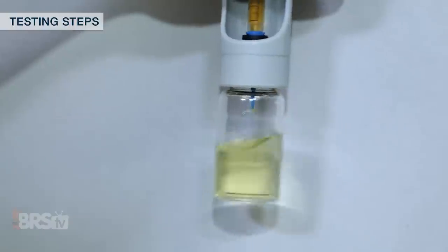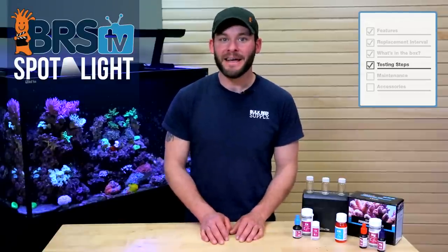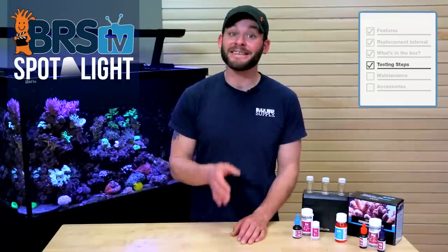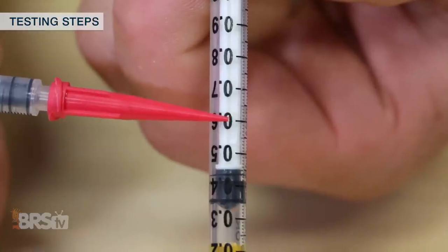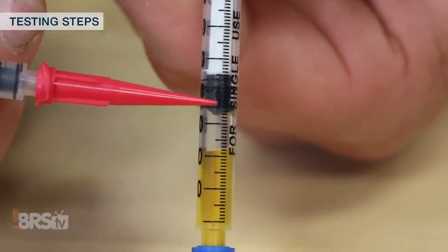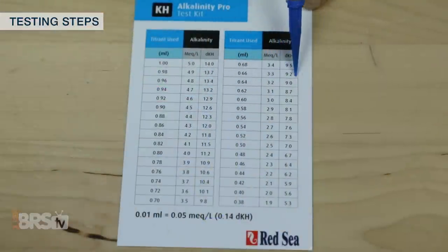For the alkalinity test specifically, if your sample turns yellow, you've gone just a bit too far. These color changes are more improved than previous versions of Red Sea Alkalinity, as we now have a distinct color change that tells us when we've gone too far, which means I no longer have to guess when enough reagent is enough. To find my alkalinity level on the chart, I'll count how much reagent I used starting from the top of the graduations and counting down the syringe. From where the bottom of my plunger stopped when my sample turned green, I can count 0.5, 0.6, and halfway makes 0.65, which I can match to the included chart on the alkalinity laminated card to find my result.